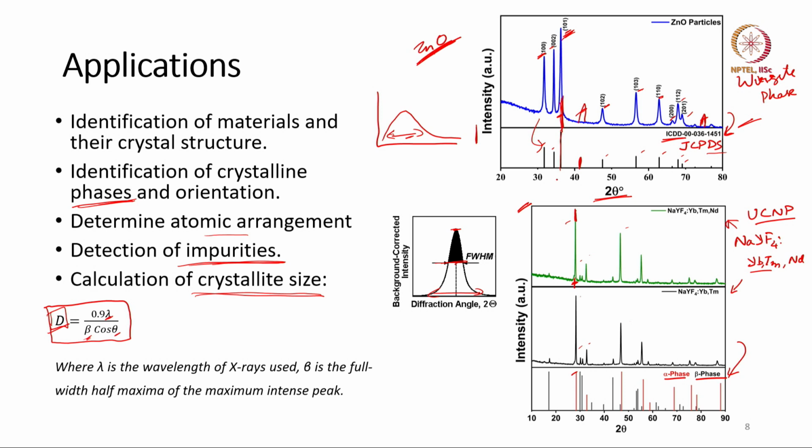So, all the impurities can be determined using XRD as well.